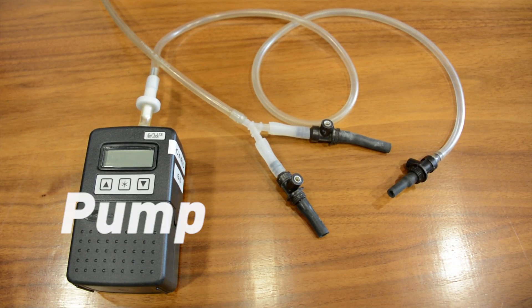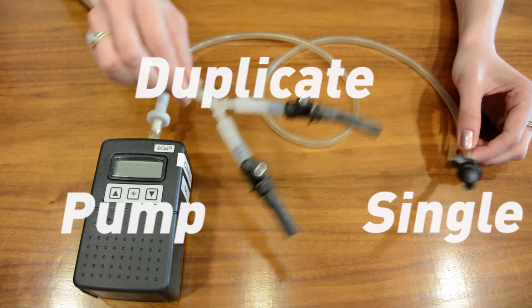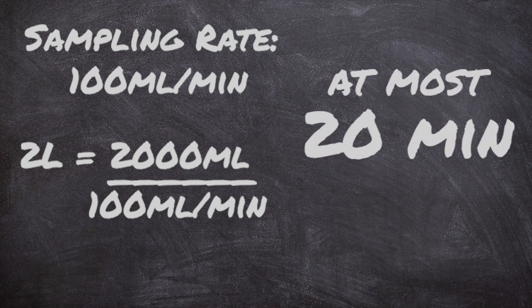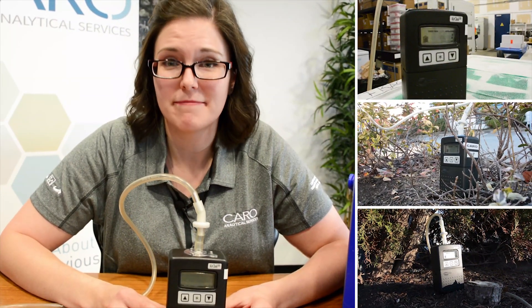Here's your soil vapor pump. Depending on if you're doing single or duplicate sampling, we'll give you an end that looks like this or this. Both calibrated to 100 ml per arm. At most you're going to need to sample 2 liters — that's a 20 minute sample time. If you're not sure how much to sample, give us a call before you go sampling. We'll be happy to help you out. You'll be able to set a timer if you wanted to, so you can set it and forget it. Set up all your sampling sites at once and get things done quick.